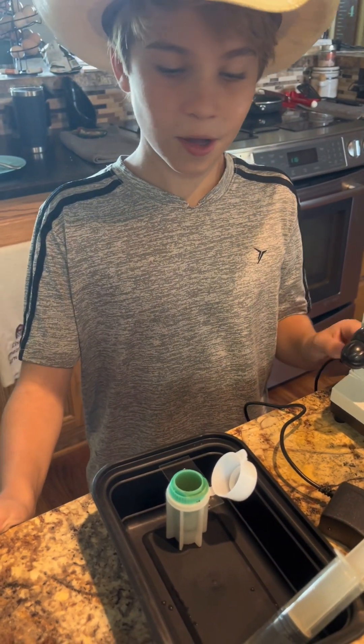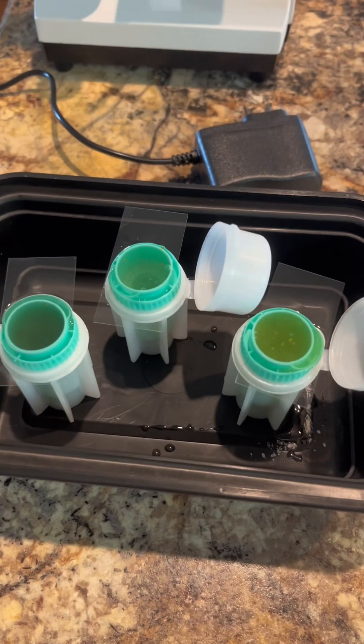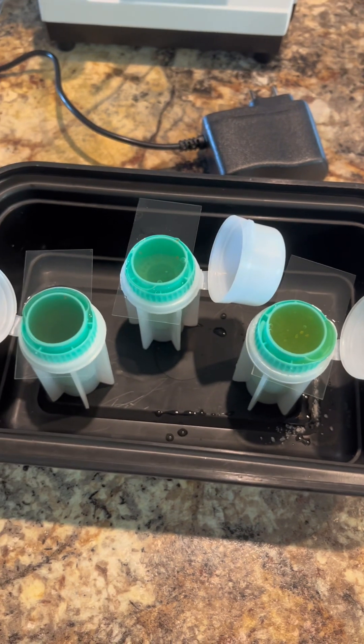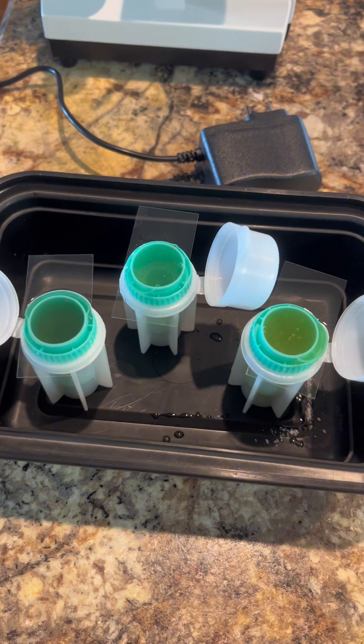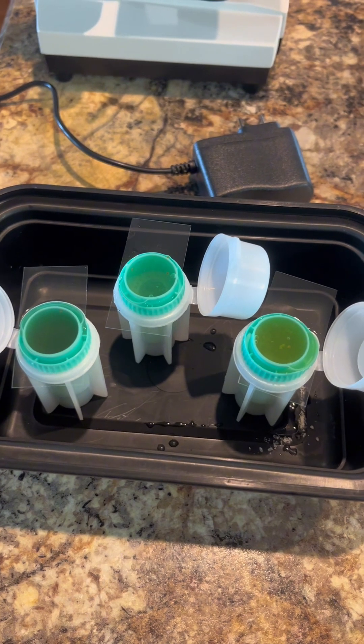You're going to leave that cover slip on there for 10 to 20 minutes depending on how much time you have. We've got two chicken poops and one dog poop with the timer going — we're just waiting to see if there are any intestinal parasite eggs in any of our chicken or dog poop.